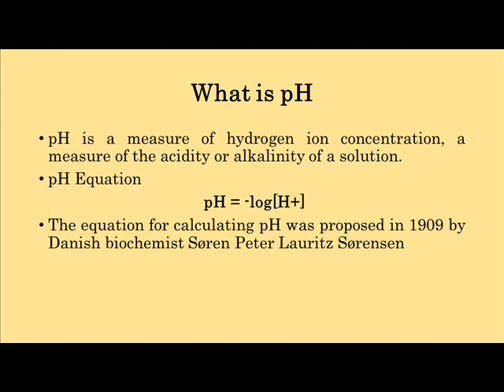We all know about pH, but, for revision, just take a look at pH. So, what is the definition of pH? The simple definition of pH is measurement of hydrogen ion concentration. In pH, we measure the acidity or alkalinity of a solution.